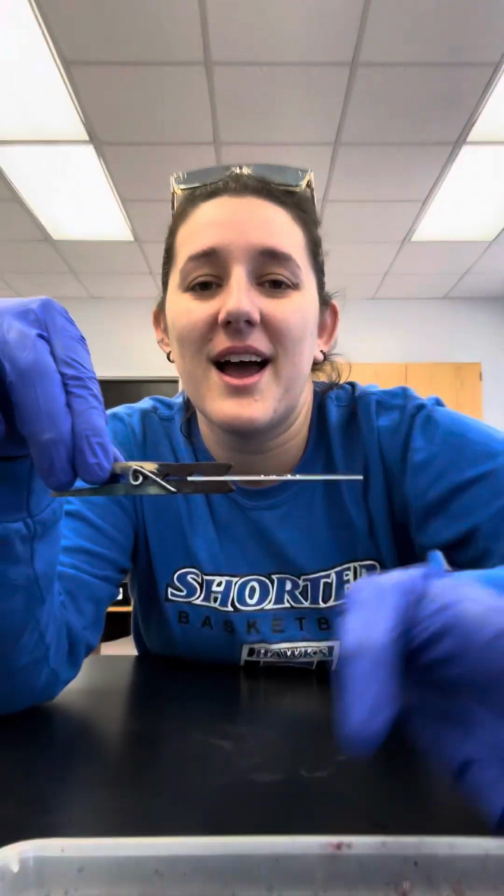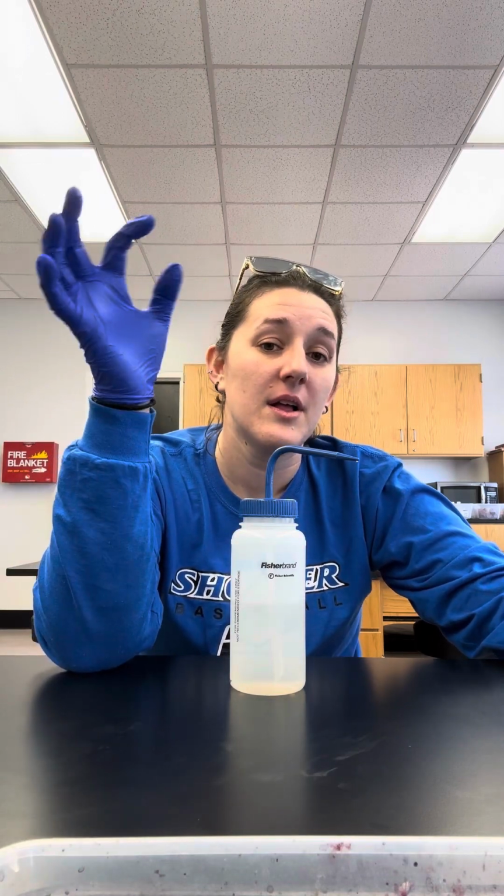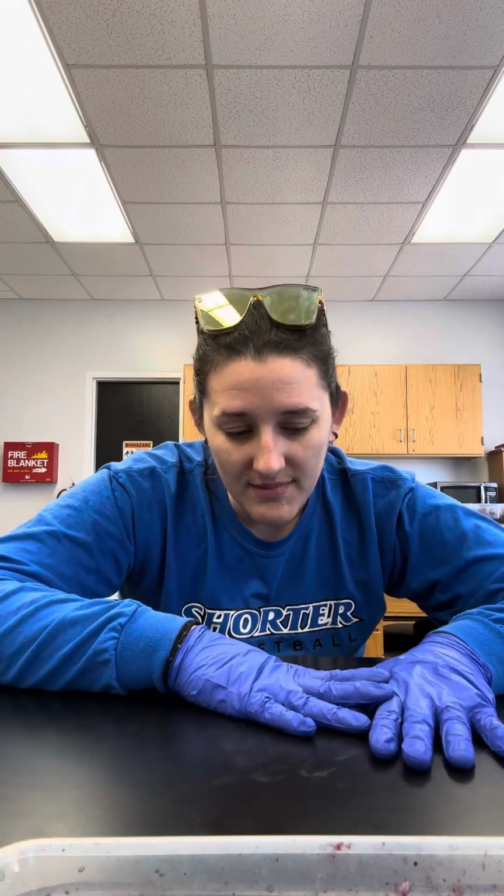Okay, sorry. All right. So now we're going to let that sit there for about a minute and a half and let that stain sink in. And then we will rinse with this, and then you observe under the microscope. This stain is really to help see shape and cluster on just about any bacteria. And it's going to stain the bacteria and not the area around it. The gram stain does the same thing. The negative stain stains the area around the bacteria and not the bacteria. That's why it's a negative stain, because it looks like a film negative.